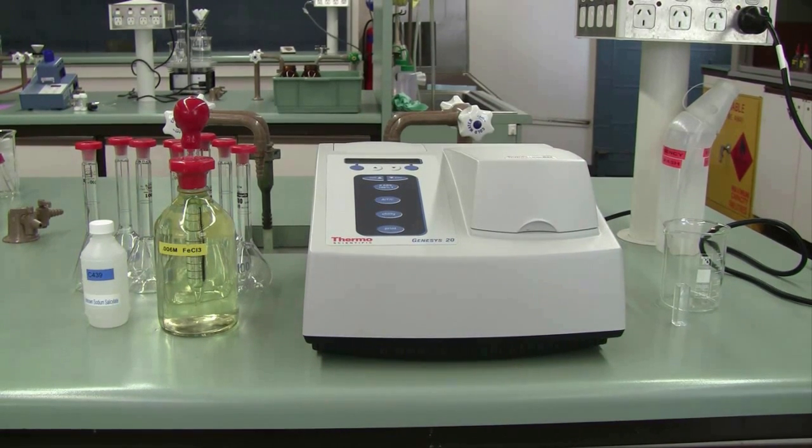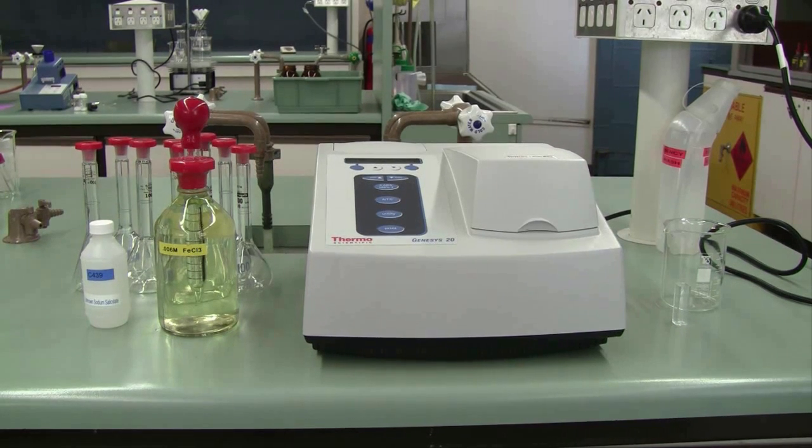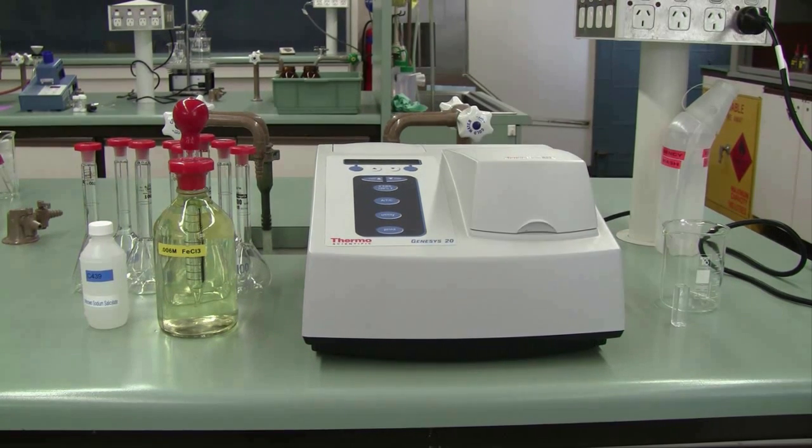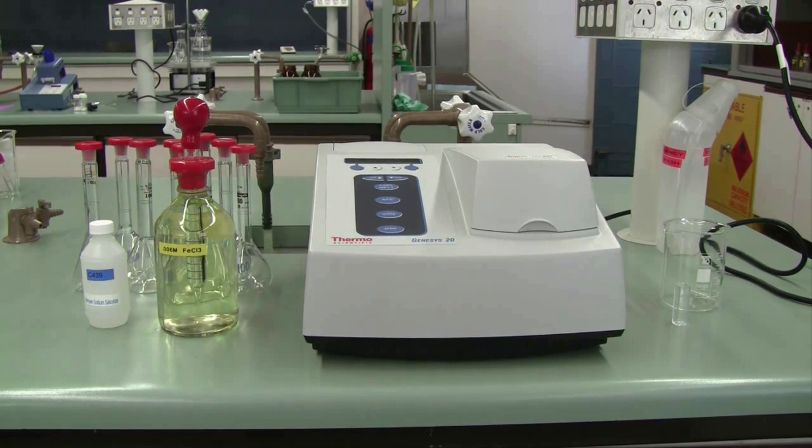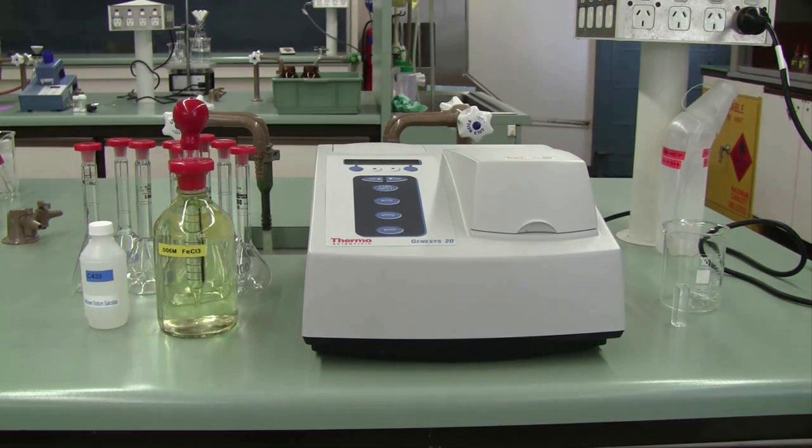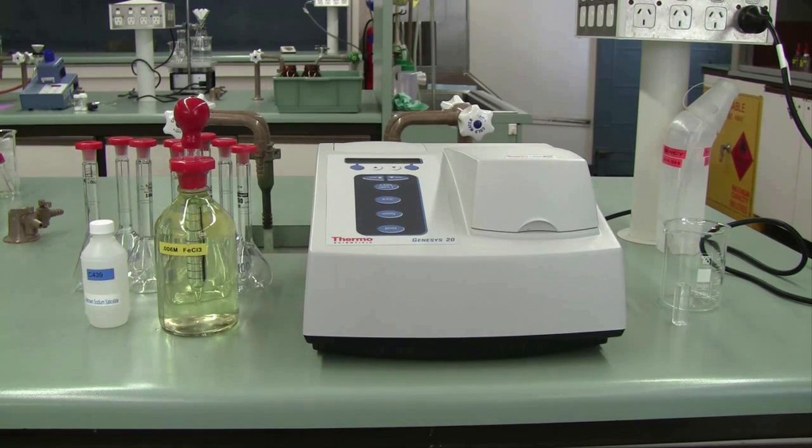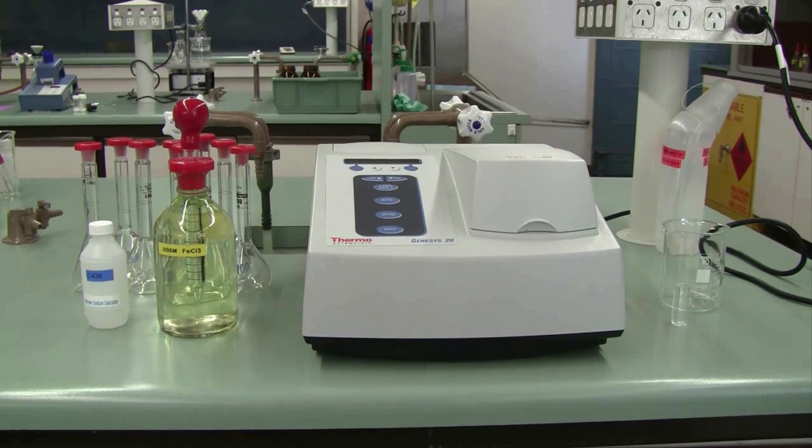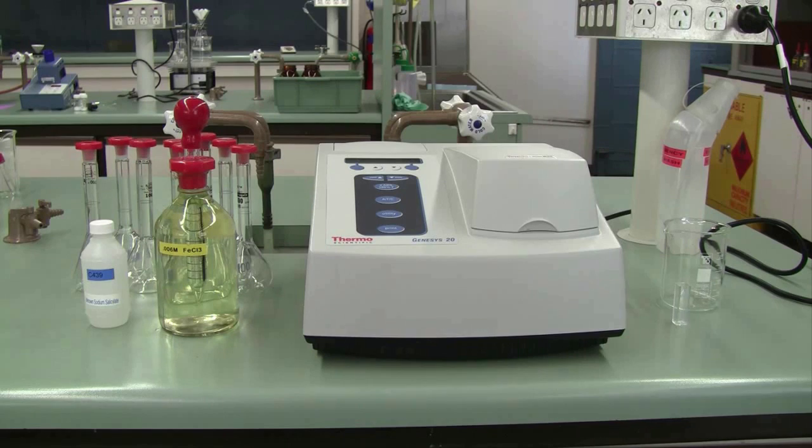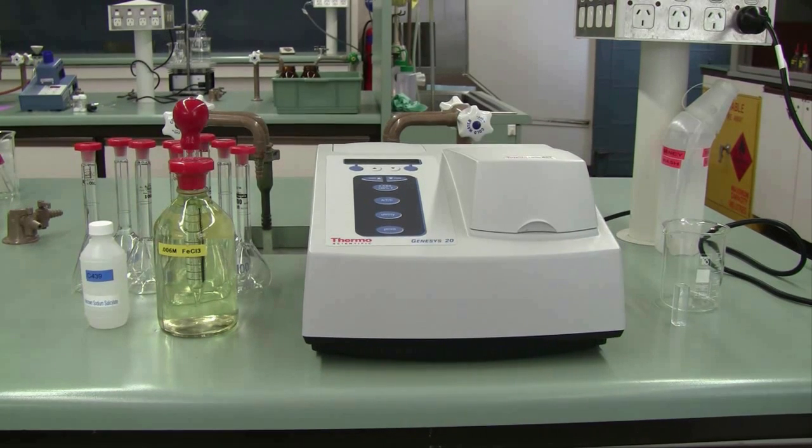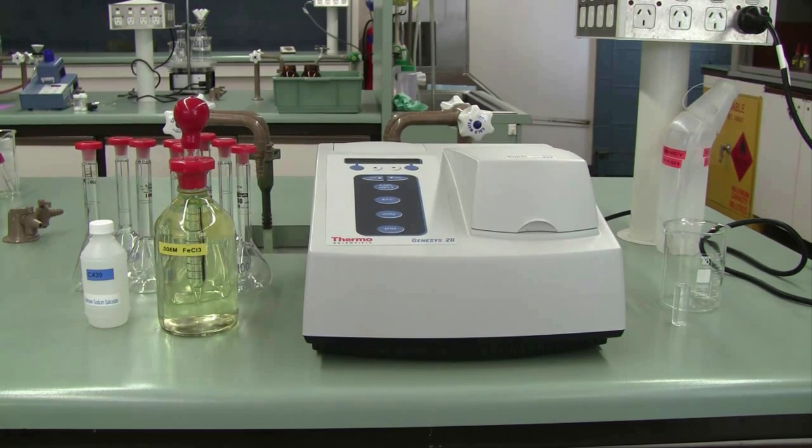You'll be given an R-squared value which will tell you how good a straight line of best fit you should get for this experiment. I would like everyone to get R-squared values that are at least 0.999, if not higher. I've had people get 0.99999 in the past, very close to one, so there's a challenge for you. Once you're happy with your results, make absolutely certain you note down your gradient and y-intercept values from the computer before you go. You'll need those to complete your write-up.